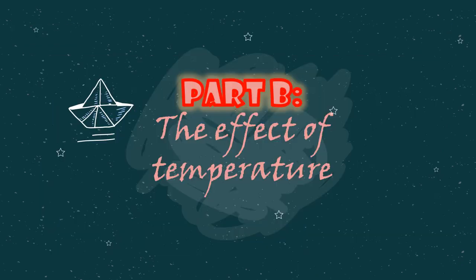Part B, the effect of temperature. Let's enjoy a short video.